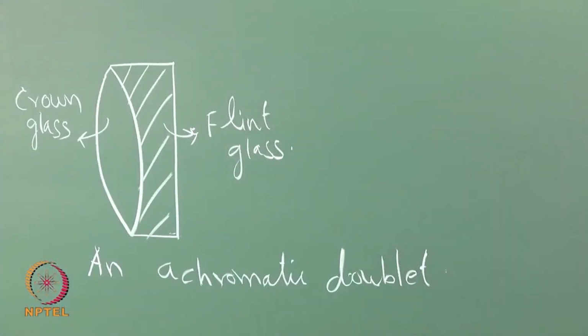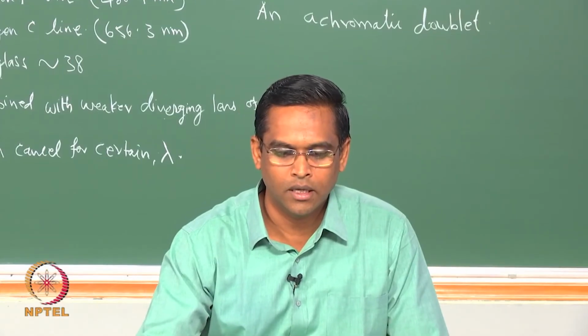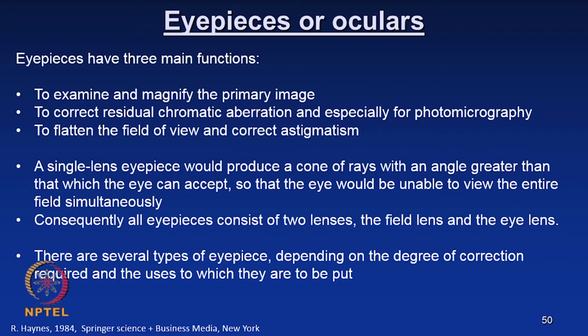So, now we will move on to the next item, that is eyepieces and oculars.